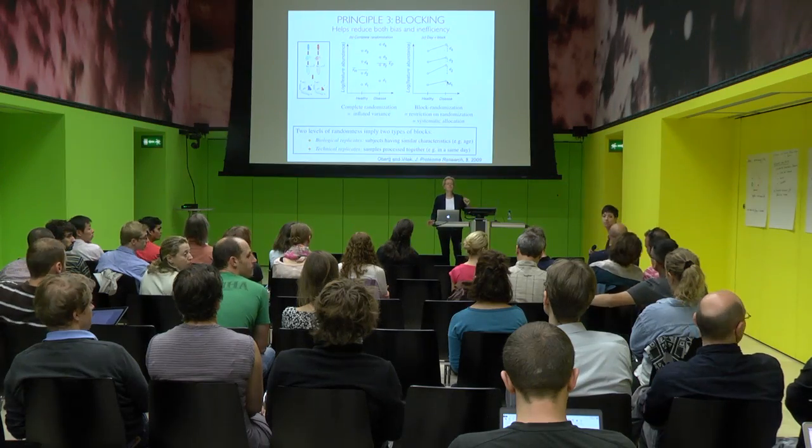So you cannot avoid it. That's unfortunately part of the variation, right? So you have healthy and disease first, but then the next one will be disease healthy, right? And maybe again healthy and disease. So you shuffle the order within each pair every time, right? But at least you have pairs of healthy and disease at different time points, as opposed to all healthy first, right, and all the disease after that.